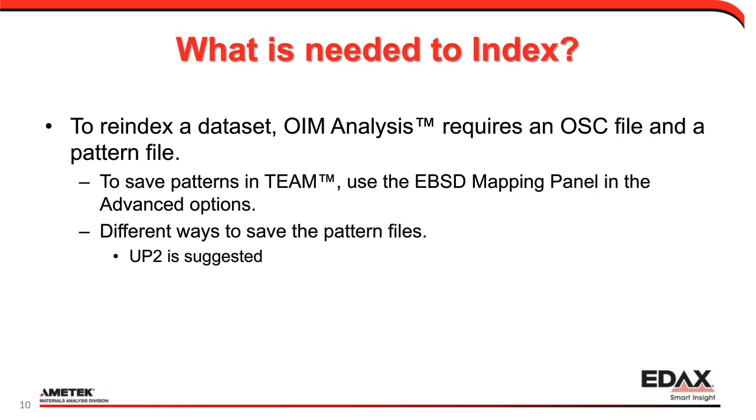One of the other things to keep in mind with these data sets is that currently, any time TEAM is closed, we turn the save patterns option off. The reason we do this is that these pattern files can get very large very quickly. If we defaulted it to on and you weren't paying attention, your hard drive could be full in a week and a half. We don't want you to say, okay, here's my data, and suddenly my computer's full. Why? We want it to be a conscious decision to say, I am saving the patterns. In the future we're thinking about changing that so it can be a user-level toggle, but as of right now, it always defaults to off any time TEAM is closed. So again, keep that in mind.